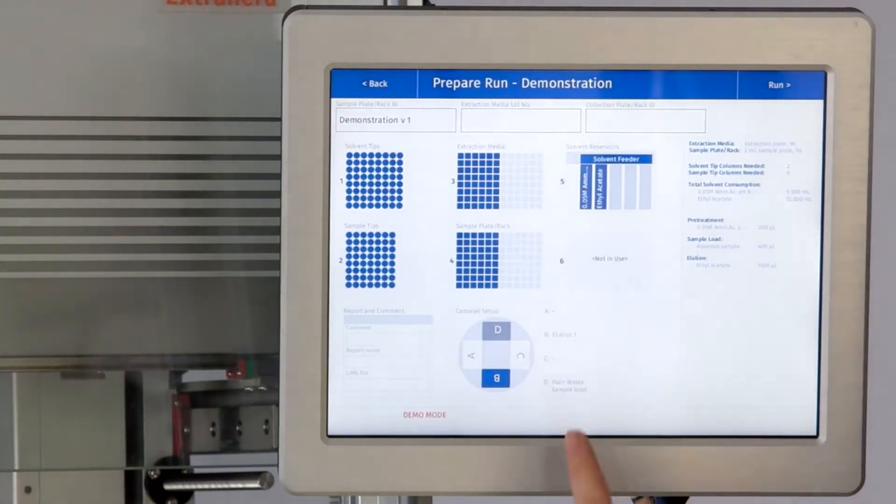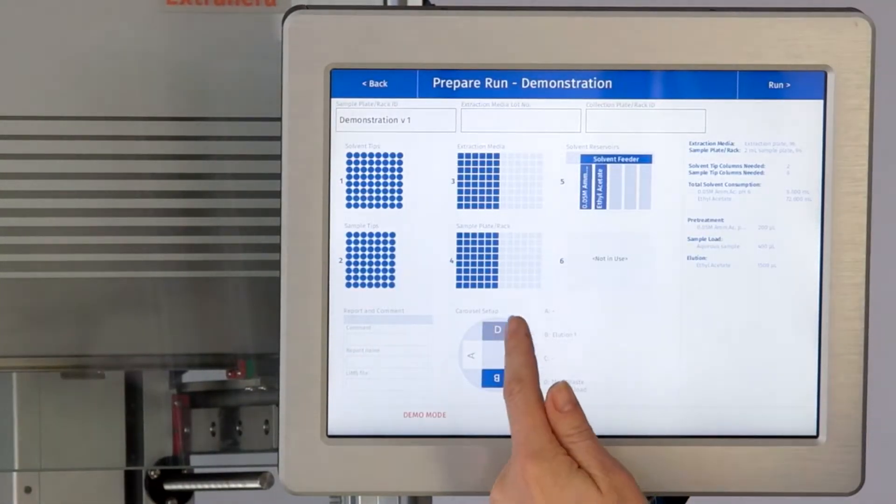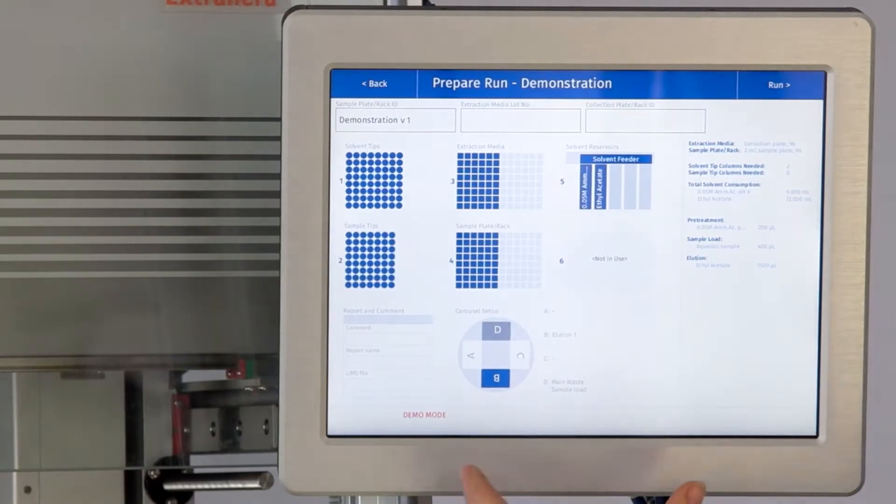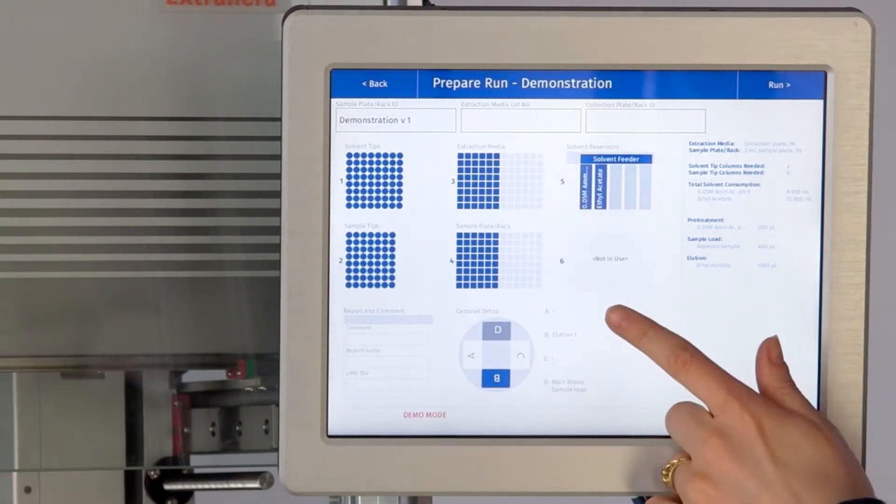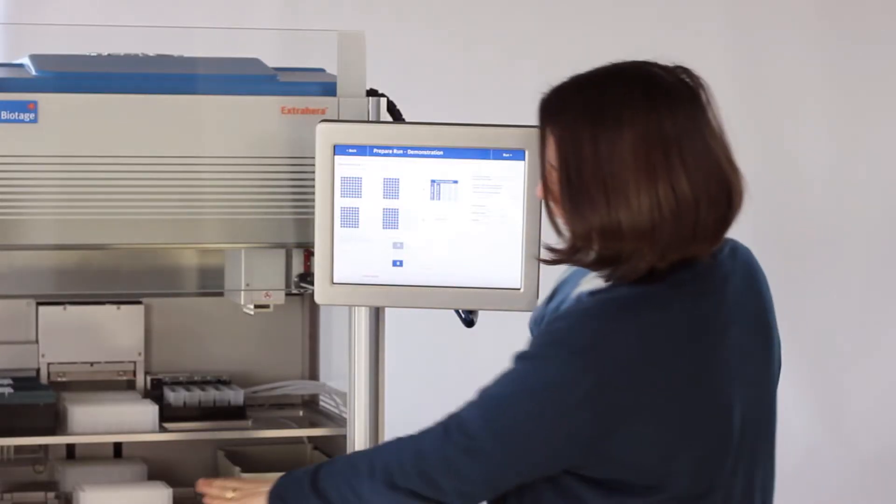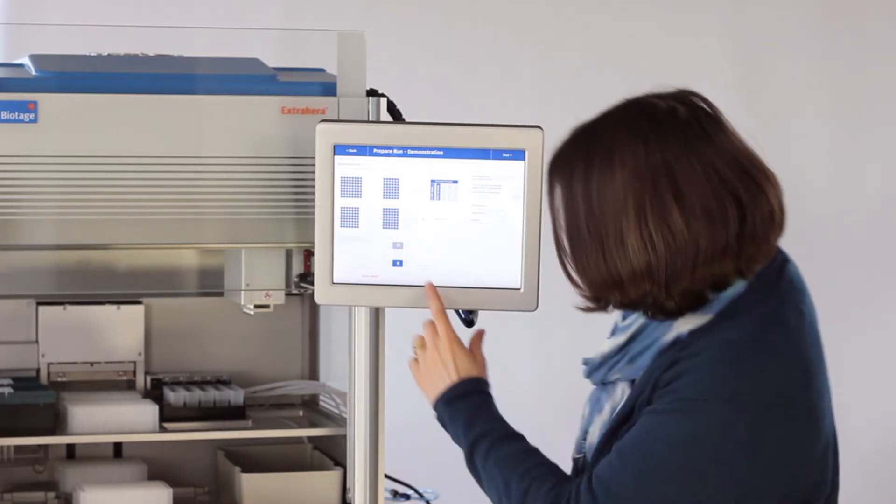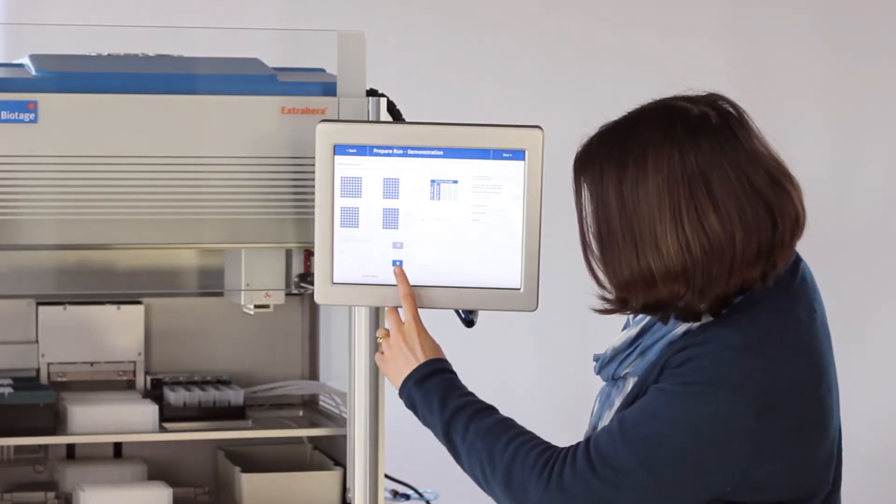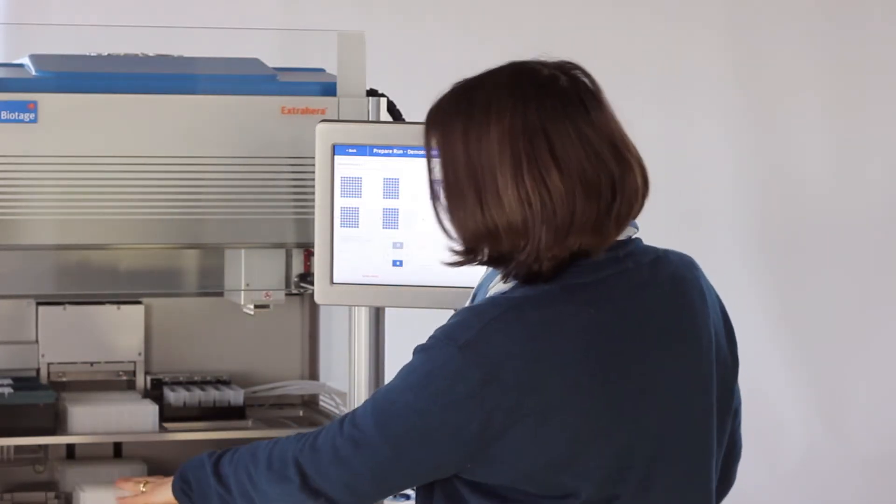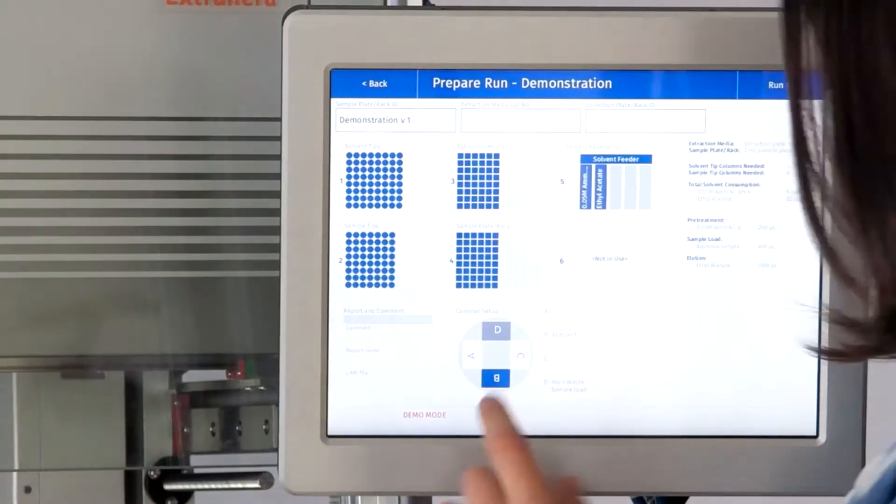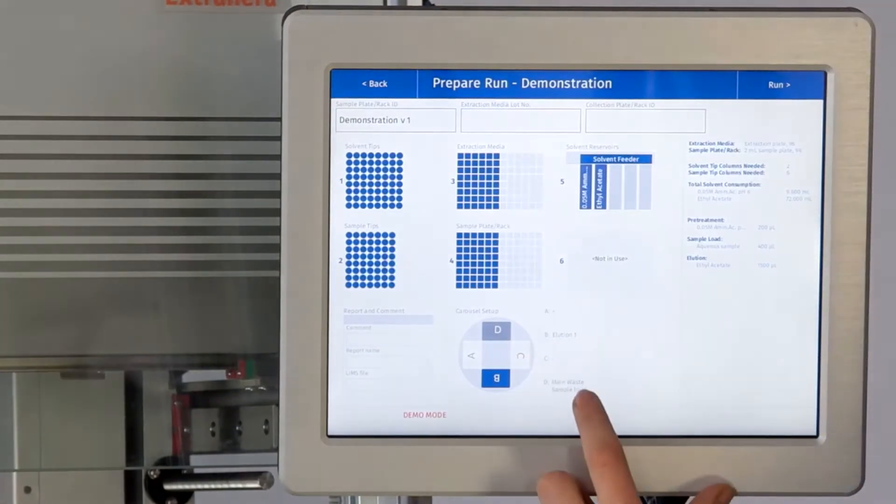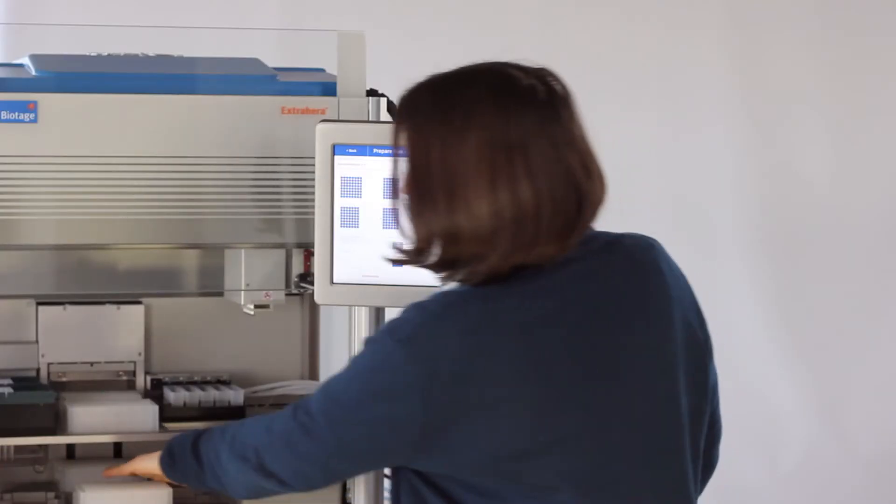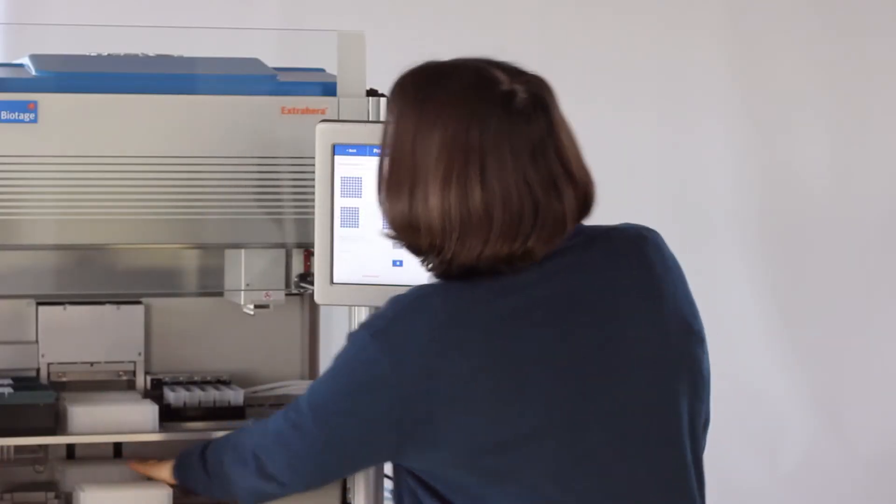You have to check that you have everything in the positions that you've asked, and it will tell you which plates should be in which point on the carousel. So we need a collection plate for elution one in position B and we have main waste in position D.